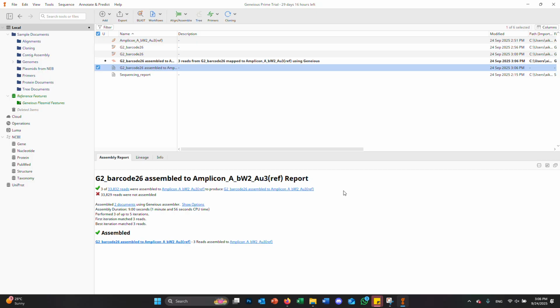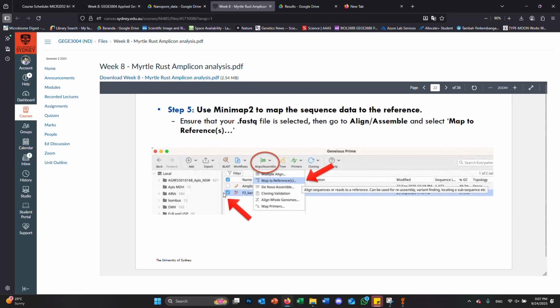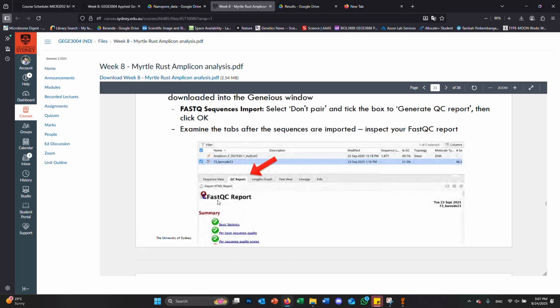There are so many ways to call consensus. James and I have probably gone through this round and round in circles with our virus sequences. What's the best way to call a consensus? Is it about the quality of the reads? Is it about just the sheer number? Do we want to call heterozygotes? Because often when you're working with pathogen data especially, you're going to have a mixed pool, with lots of different genotypes altogether. So your consensus sequence reflects any inherent variation. You can actually get that variation captured by calling a heterozygote.